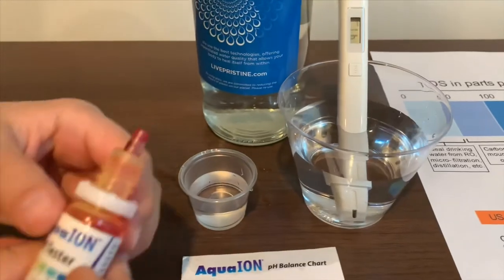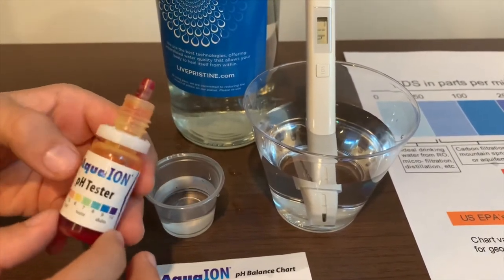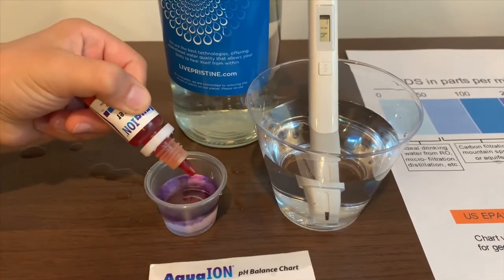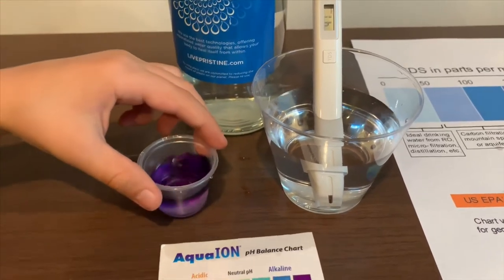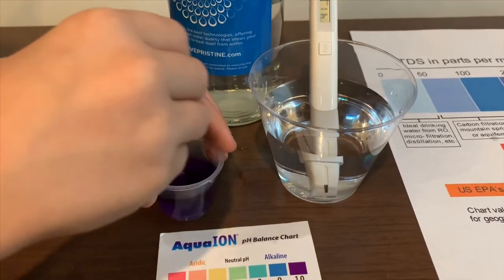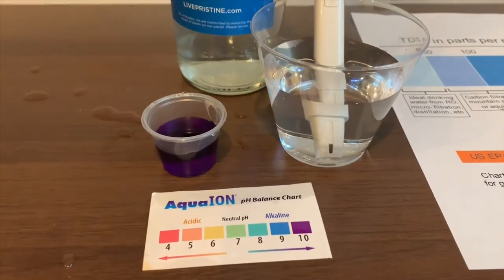Now let's test the pH level — we only do two drops. If you want to buy this pH tester, check the link down below. Let's stir it a little. I give this a 10. This is alkaline water.